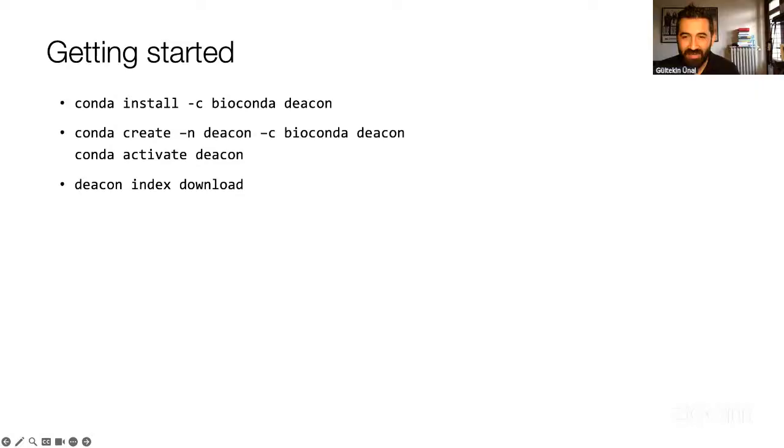How do you score your Deacon tool, 1 to 10, compared to other tools? Compared to other tools, well, I'd say most of the other k-mer-based tools are Kraken based, and then the others are mostly alignment based.